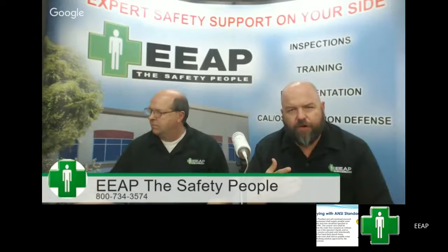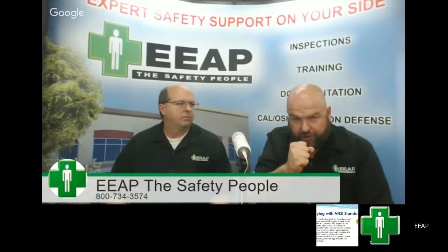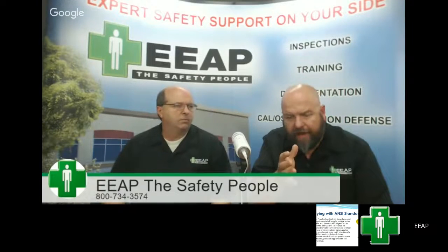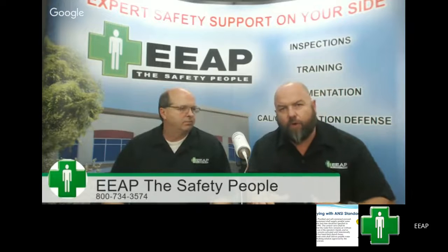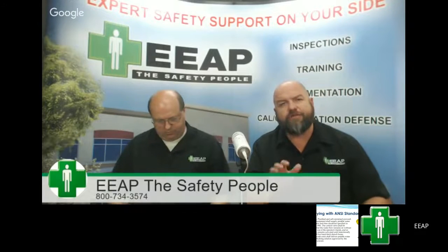And you'll notice with the hose that you can grab, when you grab it, it's going to activate it, and you can hold it up to your eyes. They're okay with whichever one you have, but you've got to make sure that they work. Those paddles sometimes will stick, and sometimes there's a secondary valve that the plumbers put in, so they're shut off. So even if you push the paddle back, it won't turn on anyways.